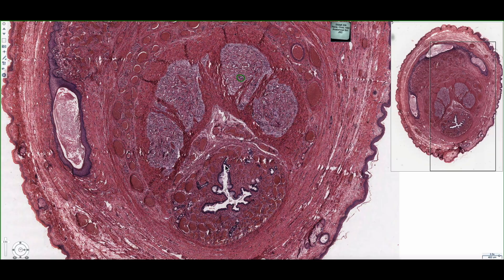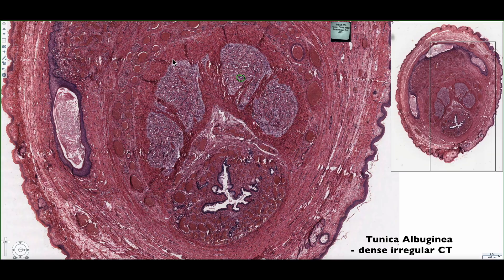Surrounding all three of these erectile tissue masses we can see this dense irregular connective tissue that surrounds all three of these structures. We can notice that this dense connective tissue is thicker around the corpus cavernosum. This is the tunica albuginea and it surrounds all three of these erectile tissue masses, being thicker around the corpus cavernosa compared to the corpus spongiosum.